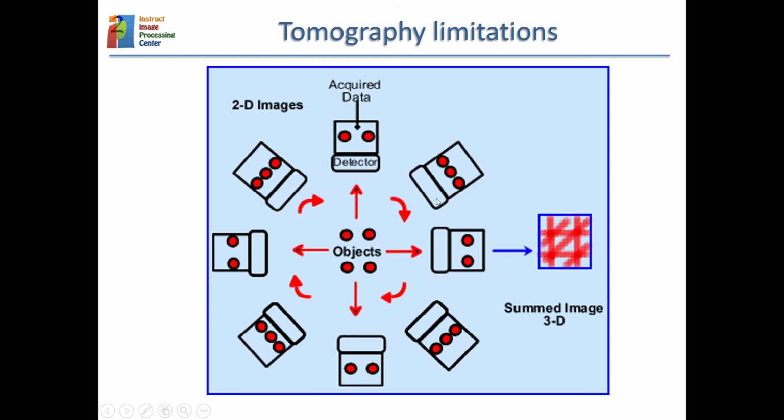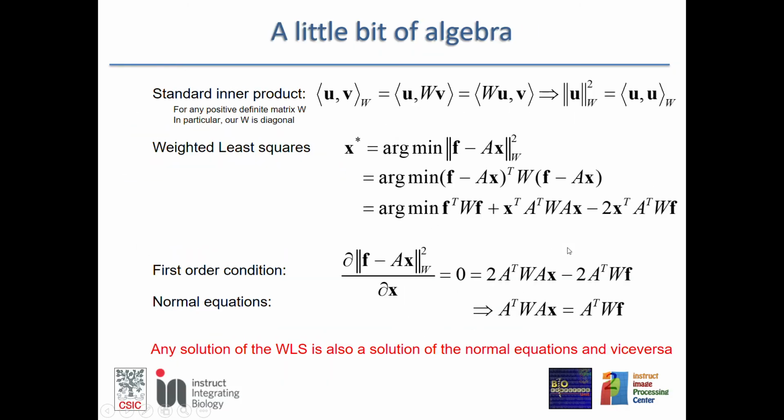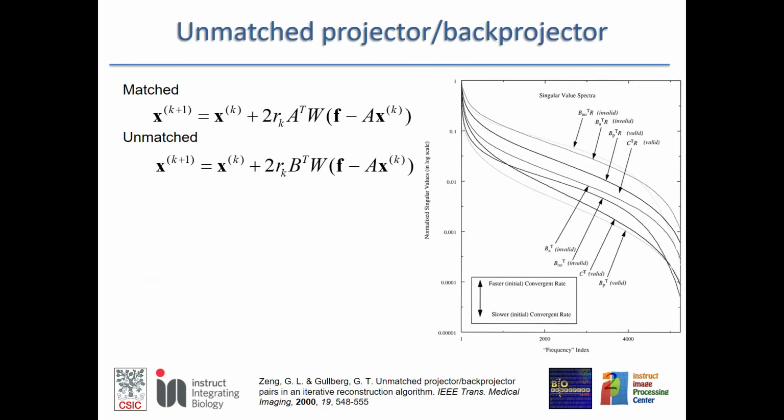But now if I put the constraint that the count of non-zero coefficients in some space, and this space could even be real space, has to be small, then I can choose between these two objects, and this one has a smaller count of non-zero coefficients than this one. That is why it is so successful in removing stripes.